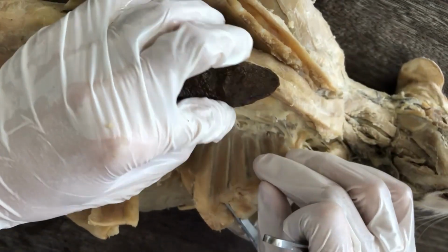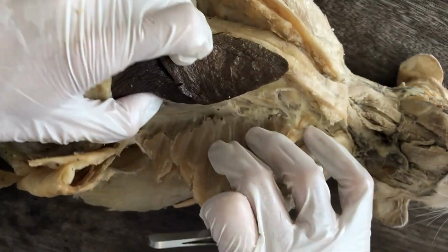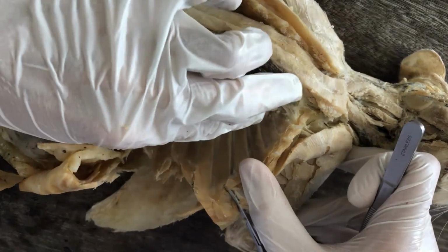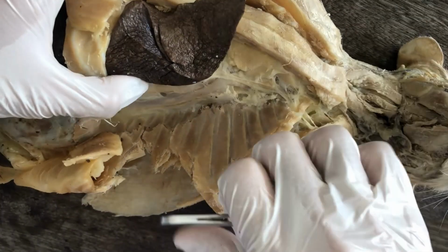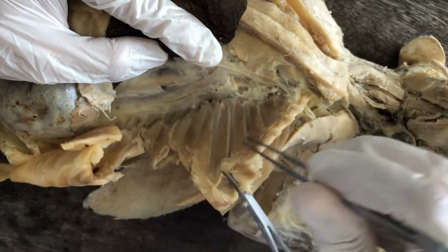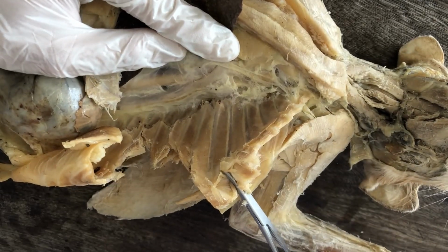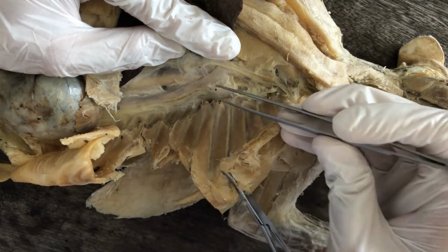So what other structures can we see? If we look at the dorsal wall of the pleural cavity, you'll see some tubes here. You have to reflect the left lung to see them. So you look at the left pleural cavity and reflect the left lung, and look at the dorsal thoracic wall.